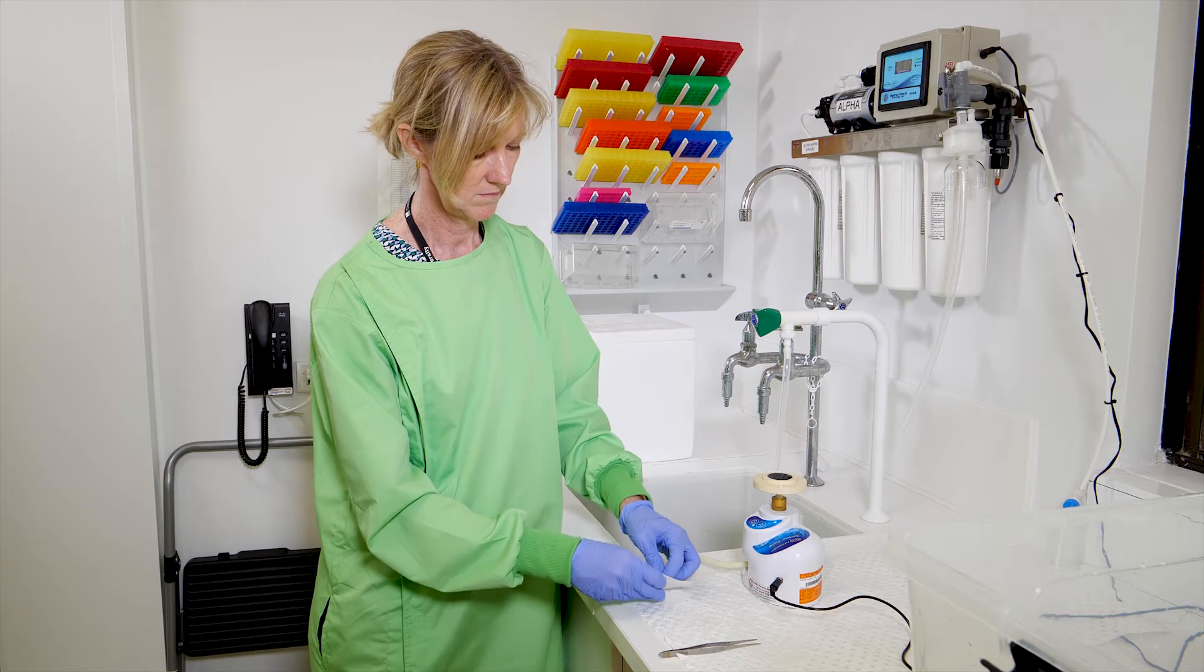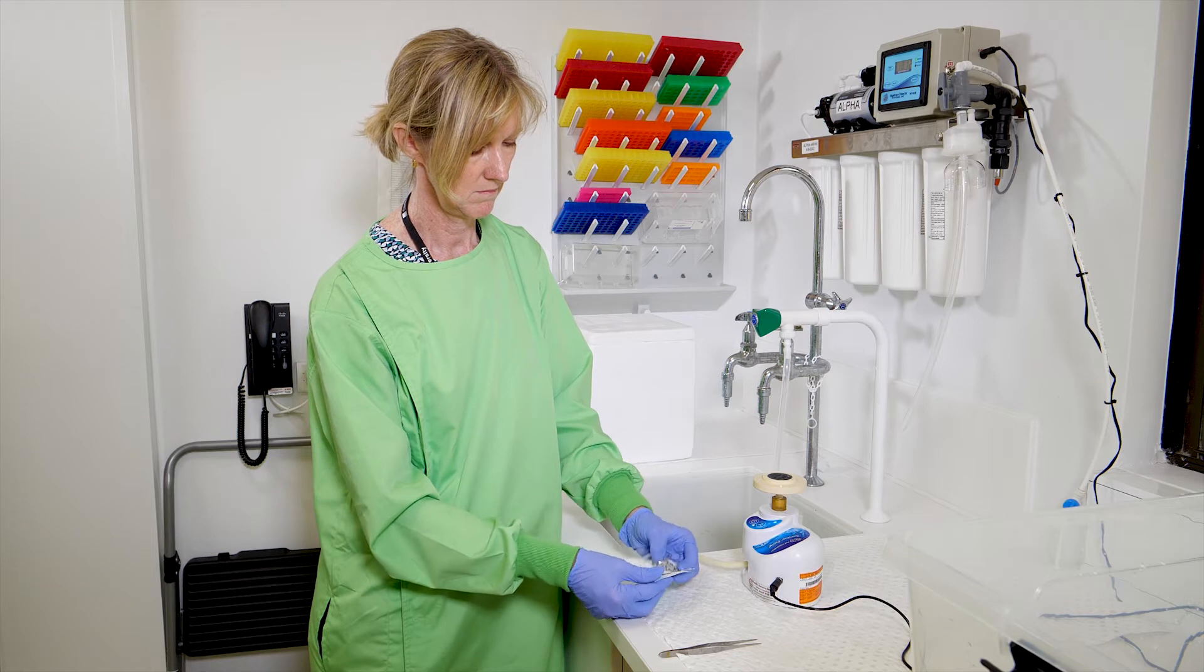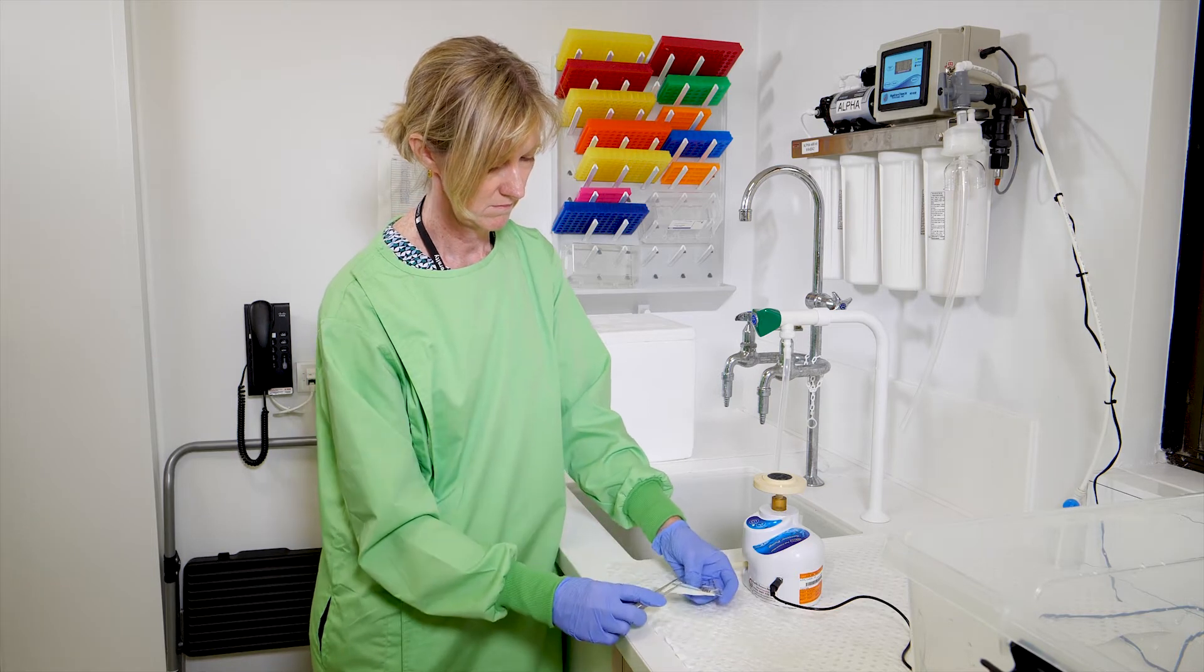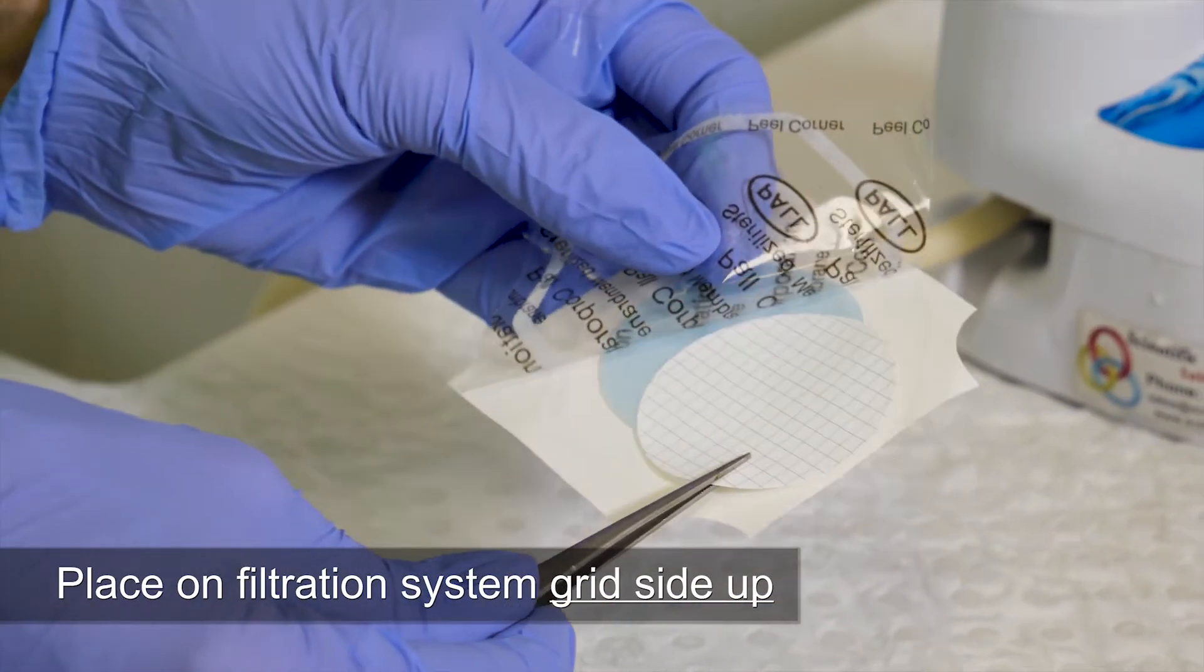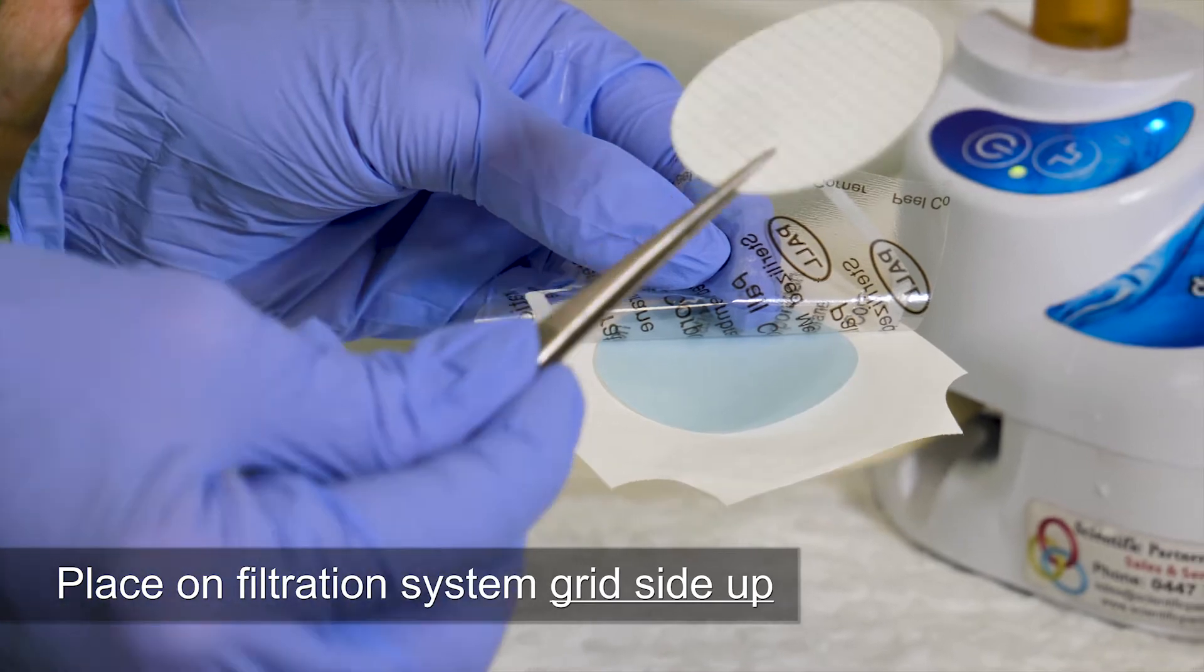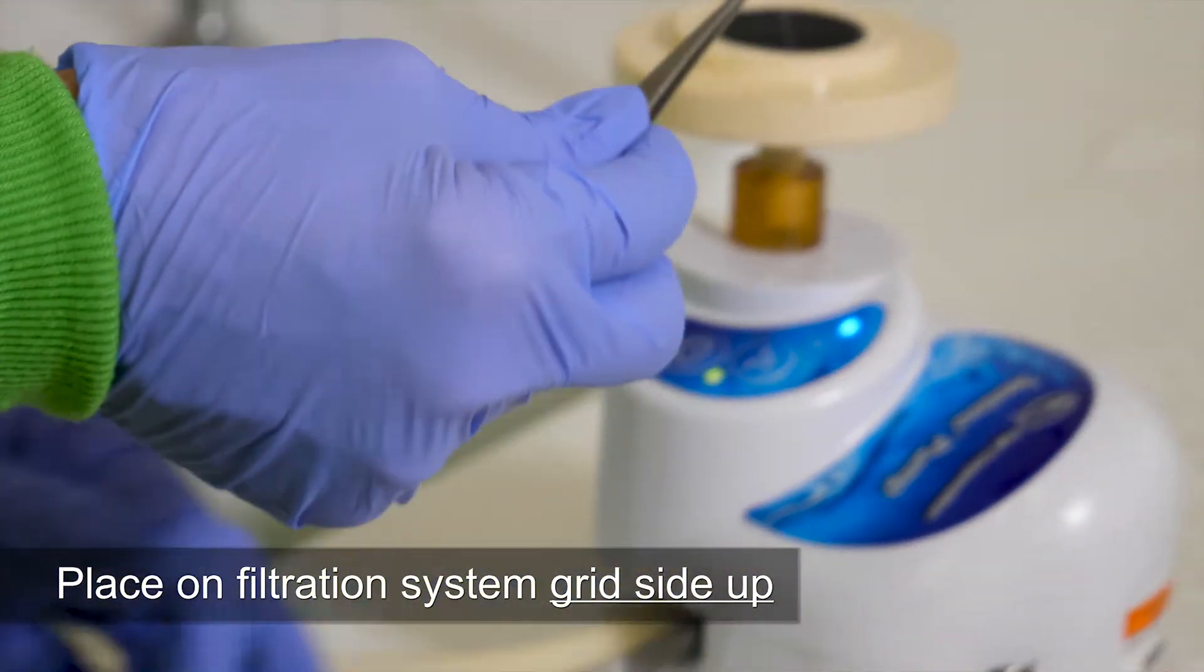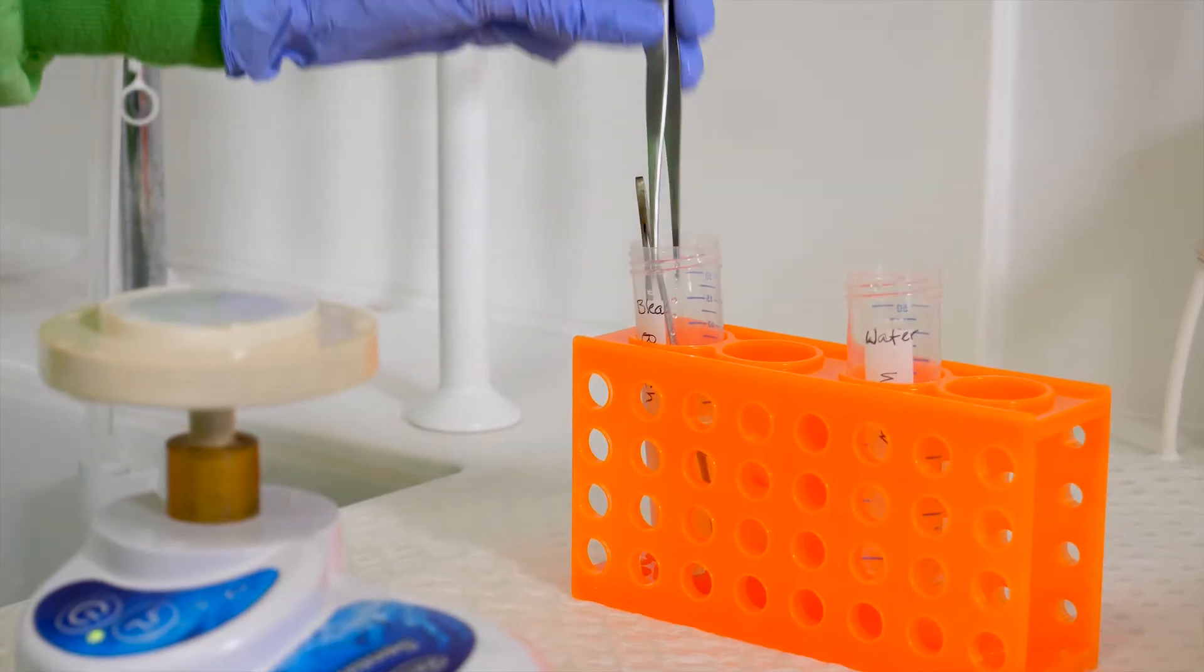Take a filter membrane and open the packaging, taking care not to touch the membrane with your gloves. Separate the filter membrane from the blue paper backing using the clean forceps. Note that the filter membrane may have a grid pattern on one side. Carefully place the membrane onto the filter base with the grid side facing upwards. Place the forceps back into the bleach to soak.